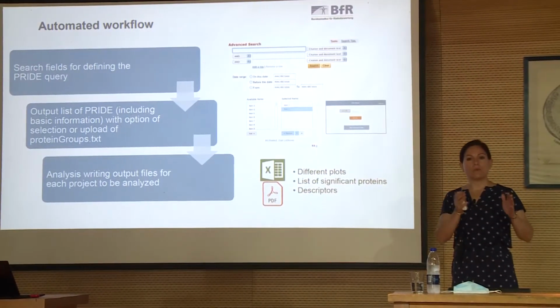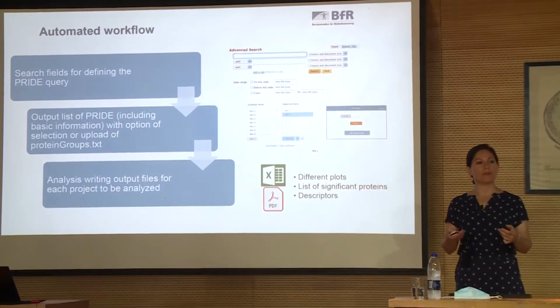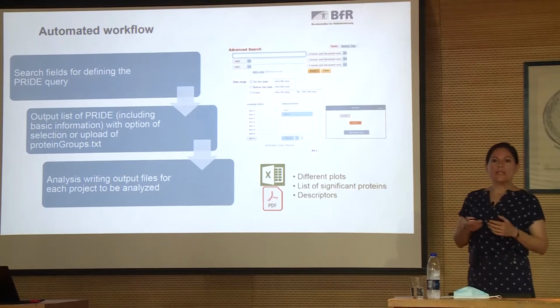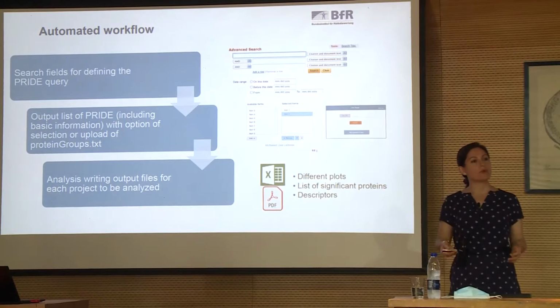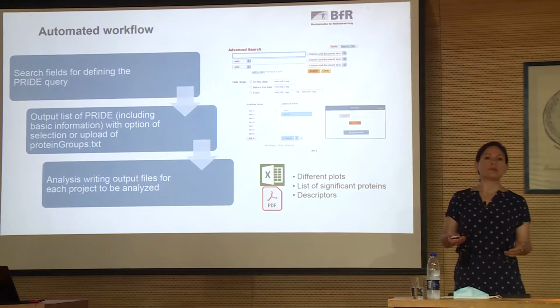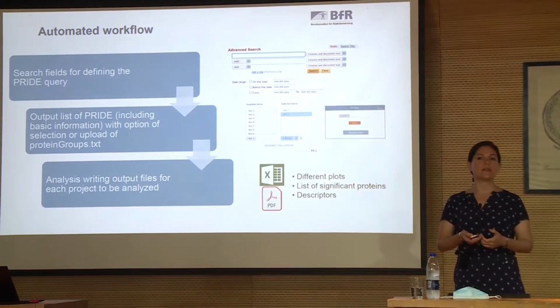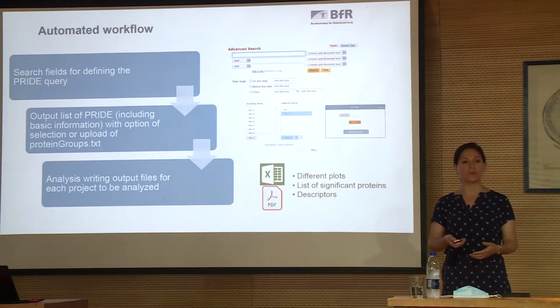And yeah, we linked these projects, but still we want to profit from them. And also all the many others related to the lung. And for this we needed a protocol or a workflow that can process all these many projects in a time frame that we can still manage. So we of course can use Perseus, and we can try to manually extract all the information, but if we want to process 200 projects or 500 of them, it's not going to work.